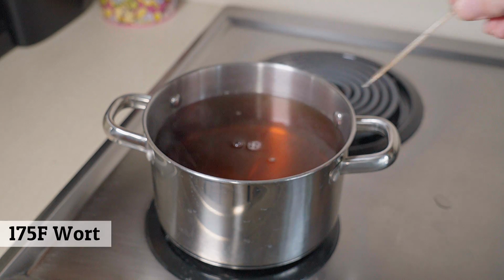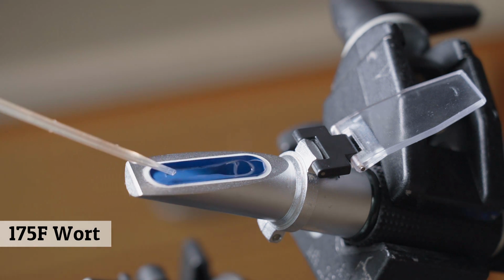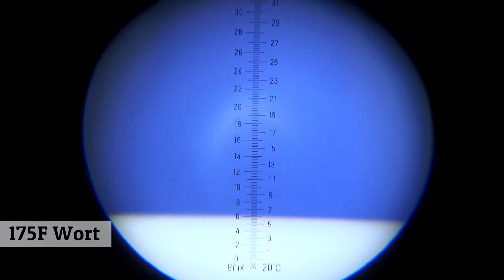Take our direct reading. Put it on the platter. And we can see the wort sample is pretty much the same. It started low, but you can see it sort of is raising here. As we watch it, we're going a little bit higher as time goes by, which is kind of interesting. I guess as the sample evaporates a little bit, the gravity is actually going up. So that's something to take note of.